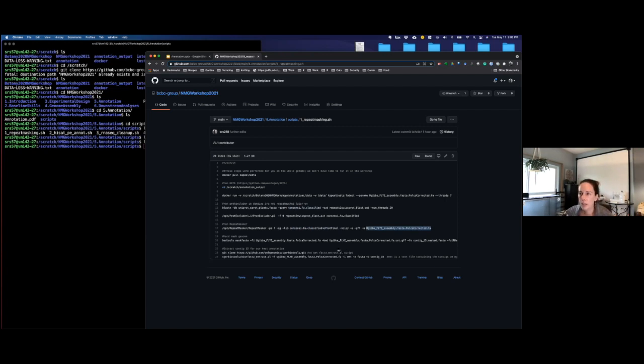So when you mask, there's hard masking, which will take anything that looks like a repeat and just make it Ns. And then there's also soft masking, which will take just the letters and make them lowercase. For this effort, we're going to use hard masking, which I think is actually output from repeat masker. There should be a GFF file, I believe, and a FASTA file. But another way to do it is you can take the GFF file here. A GFF file is just a tab delimited file that tells you where things are found in the genome. We'll generate one of these for the gene models too. But in this case, this is just telling us where in the genome we seem to have things that look like repeats.